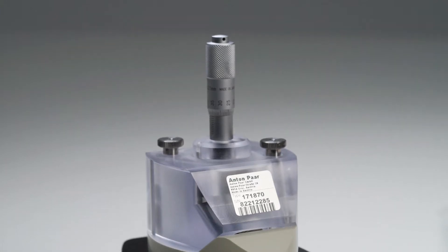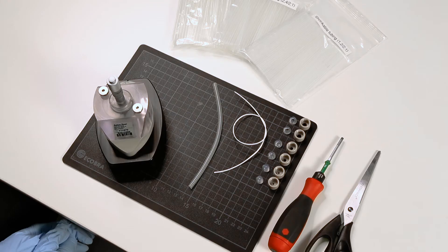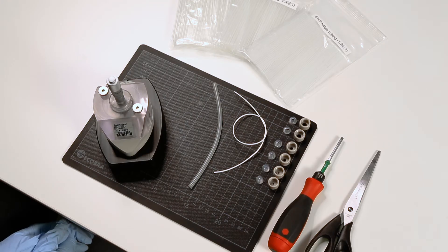This video is to show you how to mount your sample in the measuring cell for flexible tubings and how to mount the cell in Surpass III. We are going to mount a conventional silicone hose as a representative sample.